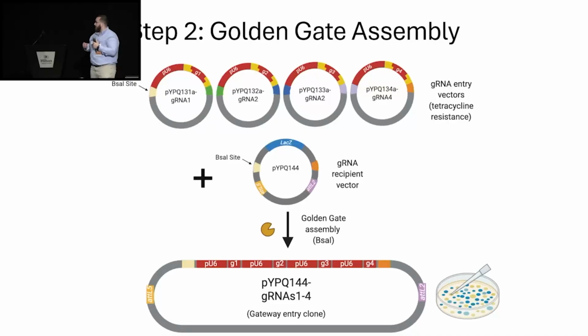And this allows for blue-white screening, so it's removing the beta-galactosidase gene. And typically, the colonies should appear white, and this is another very efficient reaction. You would only need to screen 1 colony in most cases. Up to many guide RNAs, just a single colony almost always gives you a perfect clone.